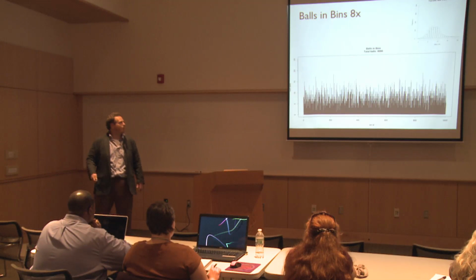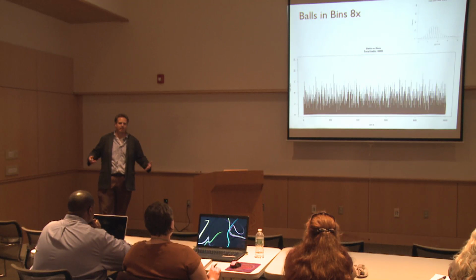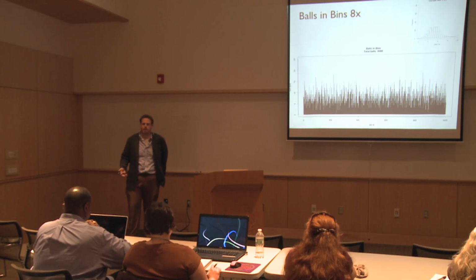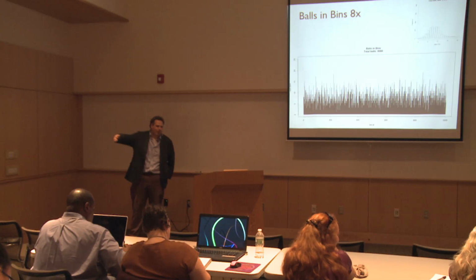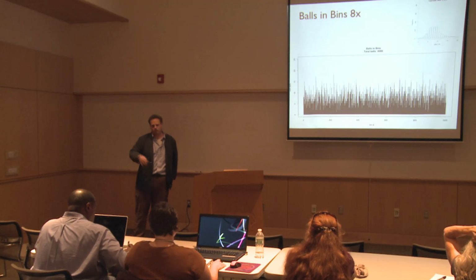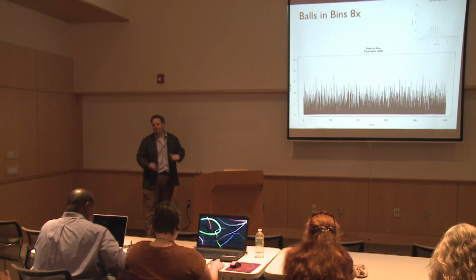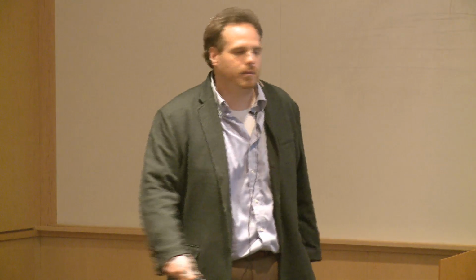that's been missing. So if you want to actually get full composition, you better go deeper than 8x coverage, plus the data have errors, plus there's biases. So my recommendation today for Illumina sequencing is to target 100x coverage, just so that you have good sampling across the genome. As you go up to higher ploidy and other complicated environments, things get really complicated where you may need to go far beyond this. If you're talking about transcriptome work, the hard part there is the high dynamic range. So if you need at minimum, say 10x of those low abundant transcripts, now you're talking about hundreds or thousands of x of those highly abundant transcripts. And it's totally driven by this.